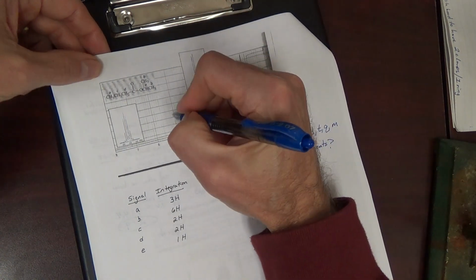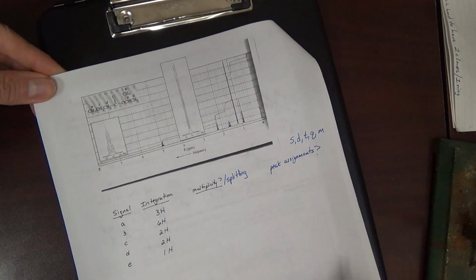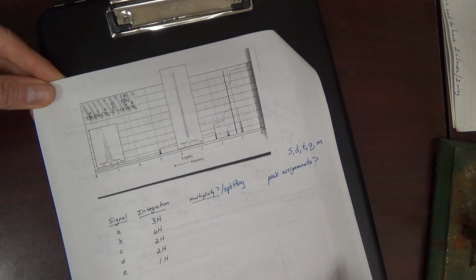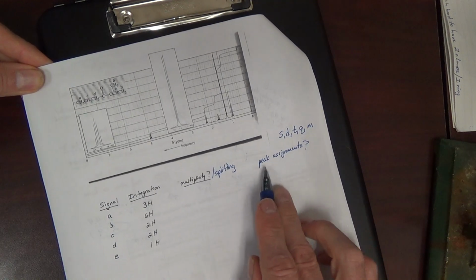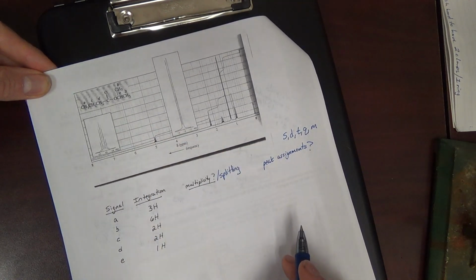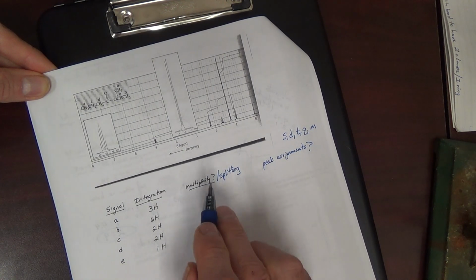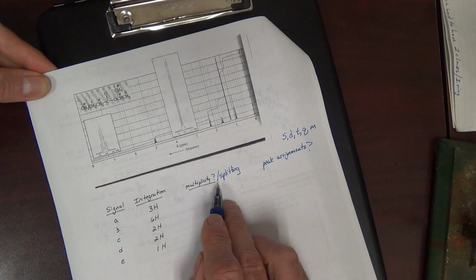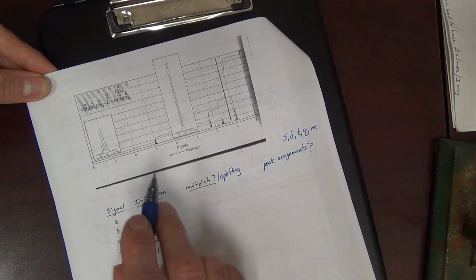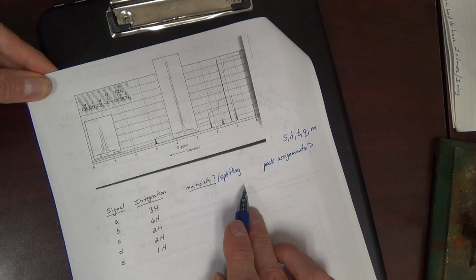You can assign these by writing the letter above each signal. At this point you'll mainly have to do that based on what peak position you expect. Once we learn splitting, you can look at the signal and look at the structure, and you can make assignments based on splitting. All right.